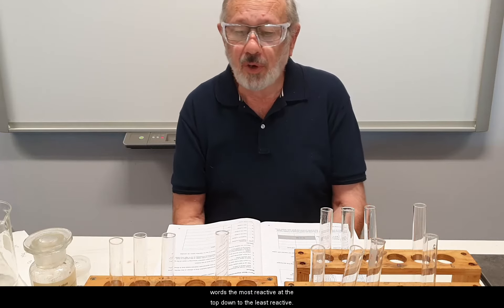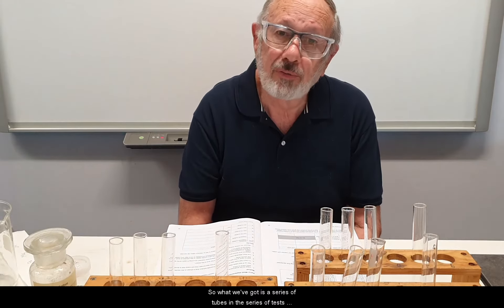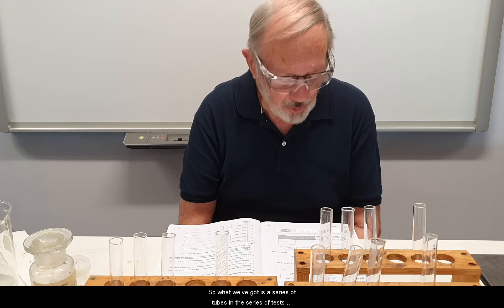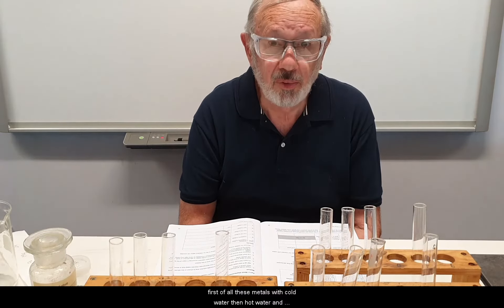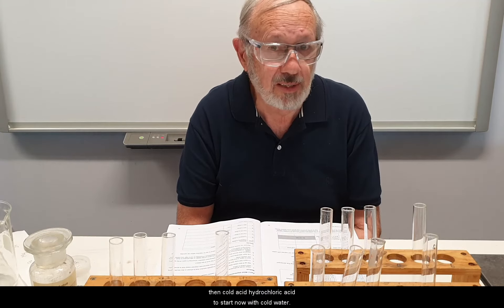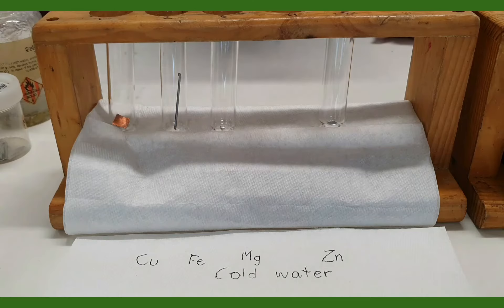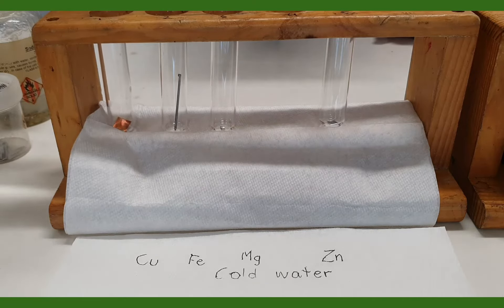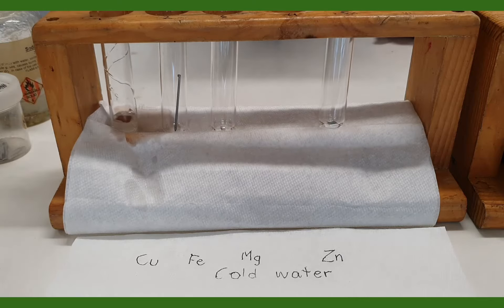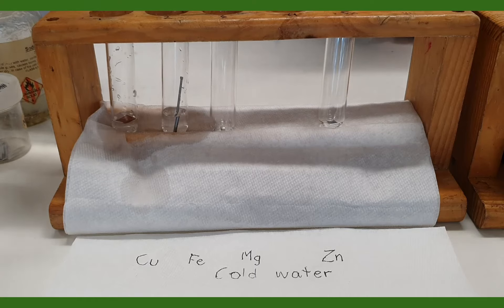We have a series of test tubes and a series of tests. First of all we'll test these metals with cold water, then hot water, and then cold hydrochloric acid. So we're going to start now with cold water. We have here our four metals — copper — and we'll just add a little bit of cold water — and our iron and the zinc.